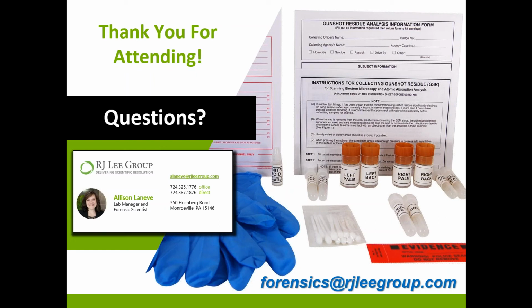Now, there are cases in which we see special elements. For example, if we see tin mixed in there with lead, barium, and antimony, then that sometimes indicates a certain type of ammunition over another. But unfortunately, we can't be specific about what type of ammunition that is.